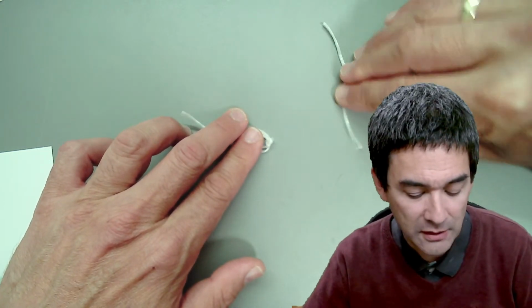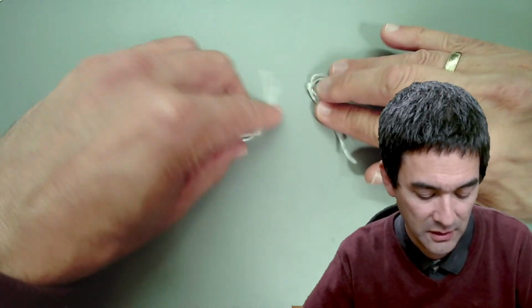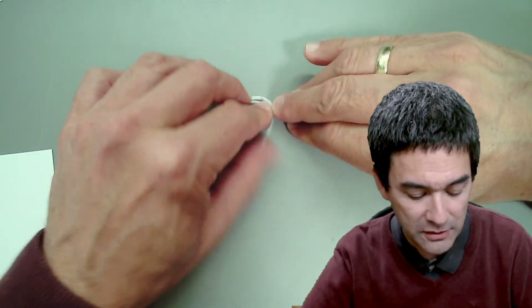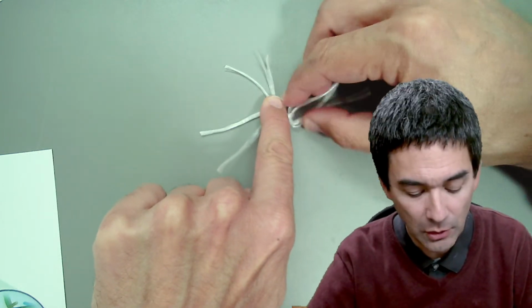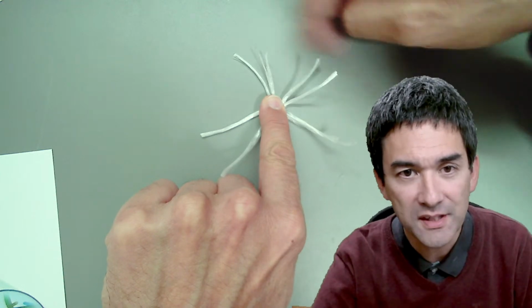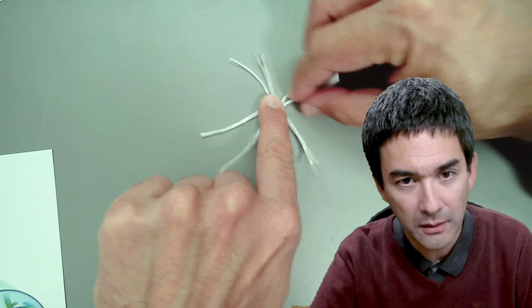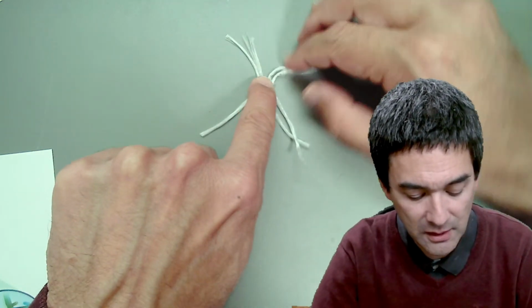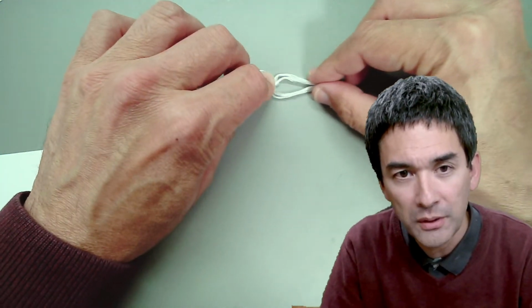As it's being pulled to the center, I have a problem right now drawing this, but those arms fold backwards. And then at the end you have a lot of these chromosomes lining up here in the middle, and you see that the arms are pointing outwards to the equator of the cell. Under the microscope, we won't see it lined up like this, but rather like this, with the arms of the chromosomes pointing outwards.